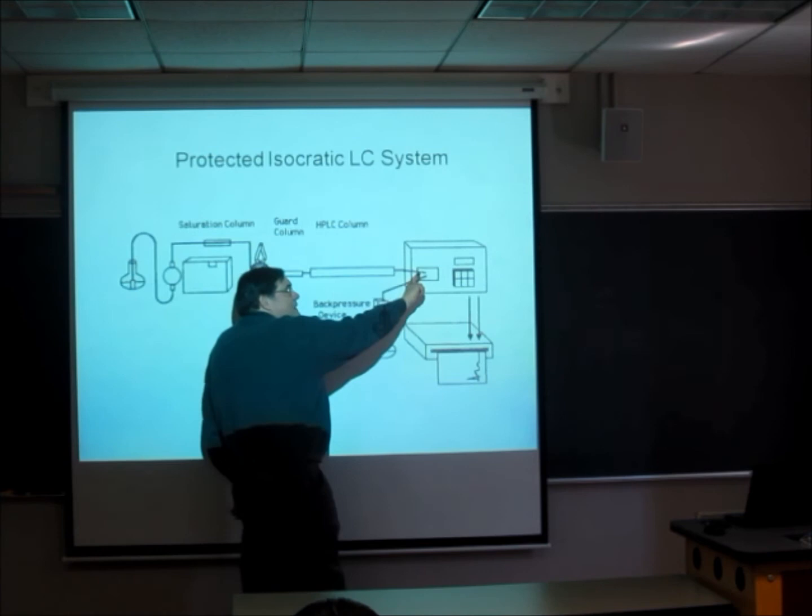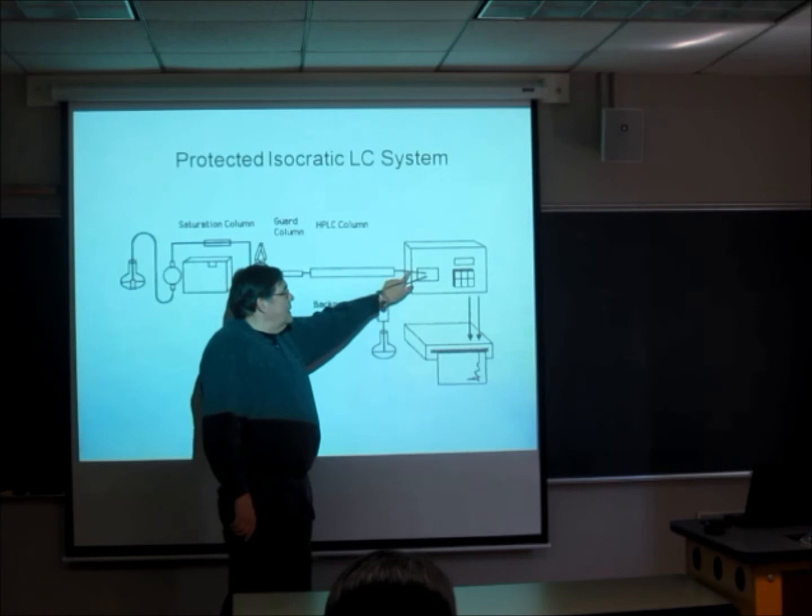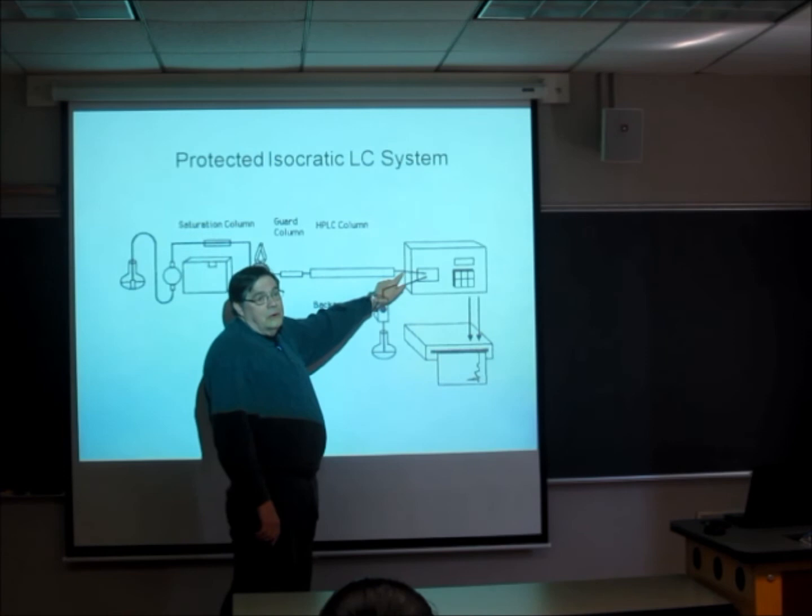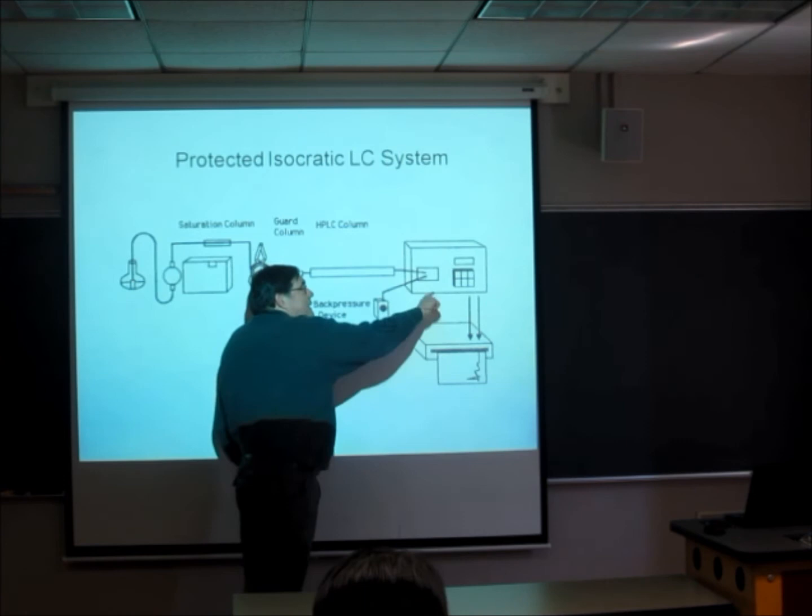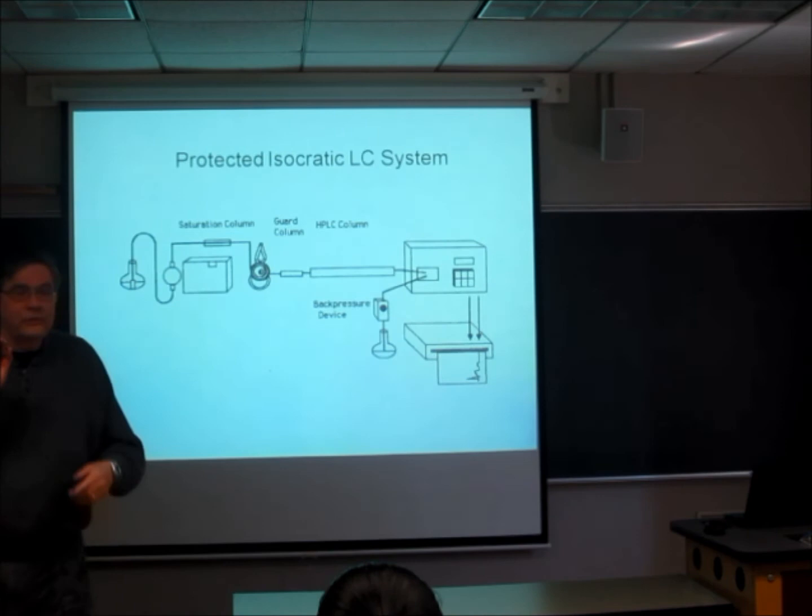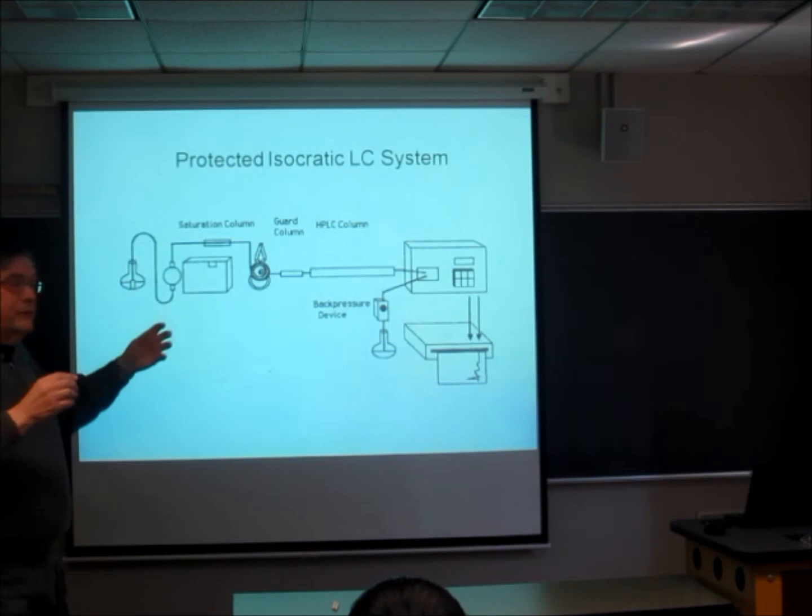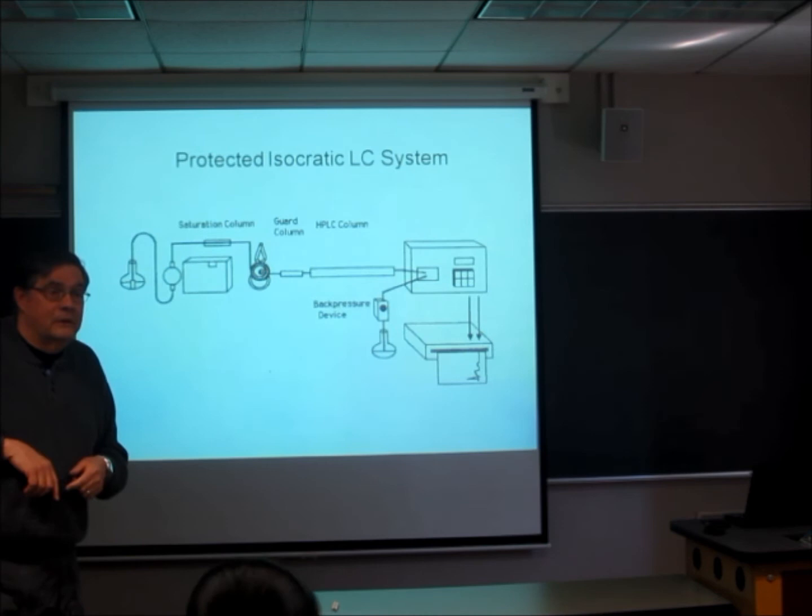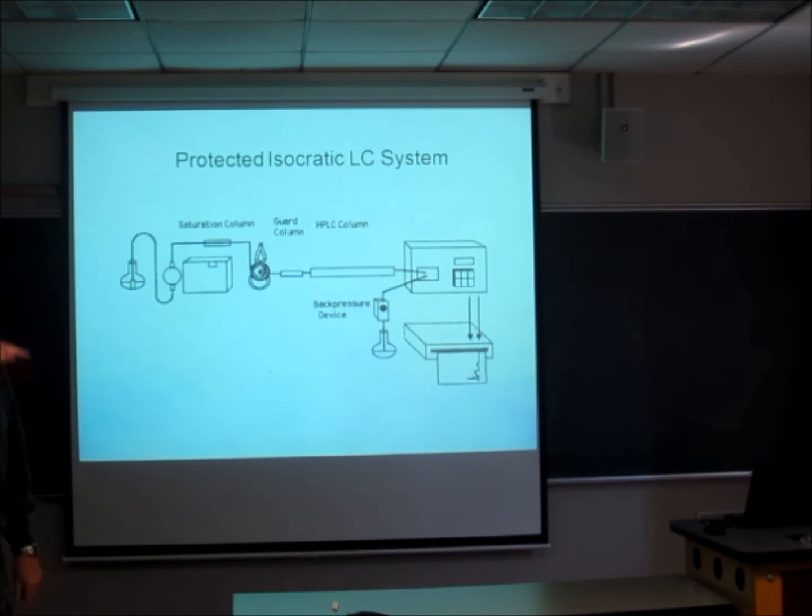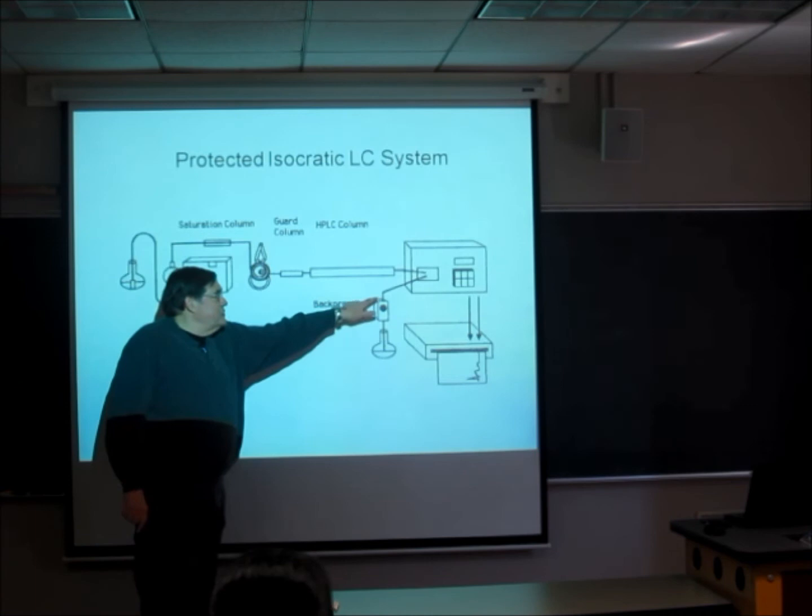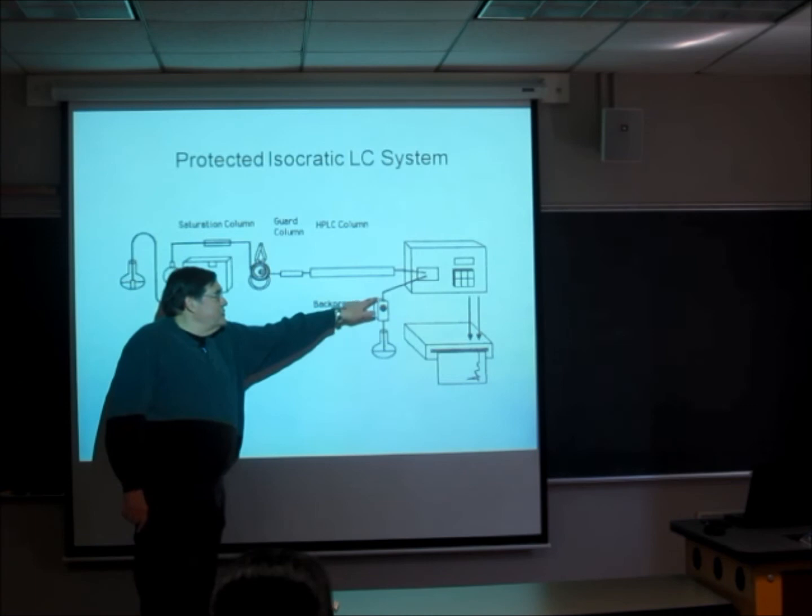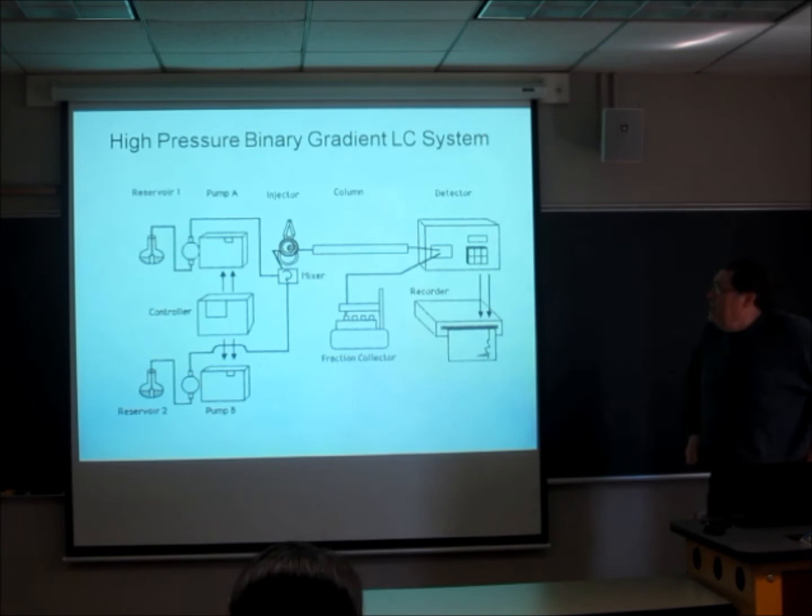So that's a guard column. And then down here, we have to have a back pressure device. If in the detector you've got an optical cell, and you've got a pressure drop from the column down to the outflow here, so this is atmospheric pressure and this is 300, 1,000 psi, something like that, you're going to get an air bubble forming in that optical path. Cavitation occurs. The low pressure will allow the gas that's trapped in the solvent to expand and form a bubble. Then you get a bizarre signal coming out of the detector.